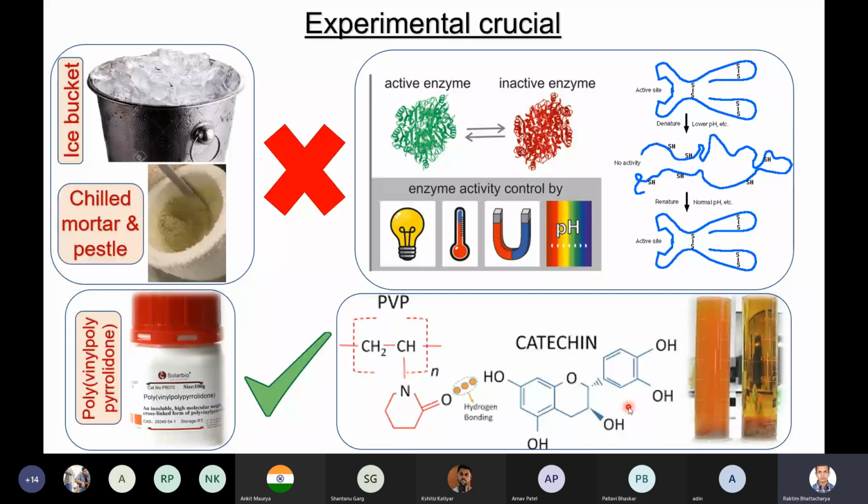Your sample contains enzyme, but after crushing, the phenolics leach out from the sample and bind with the enzyme. So when you are measuring the enzyme, you find no free enzyme in your sample. By adding PVP, you keep catechin busy. Catechin will bind with PVP instead of enzyme, and your enzyme will become free in the solution so that it can be assayed using our traditional method.